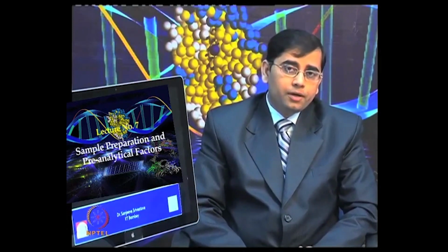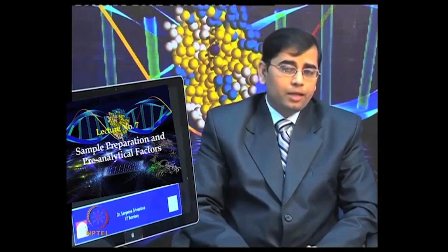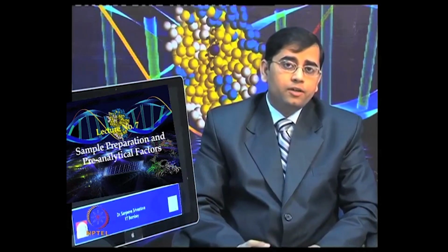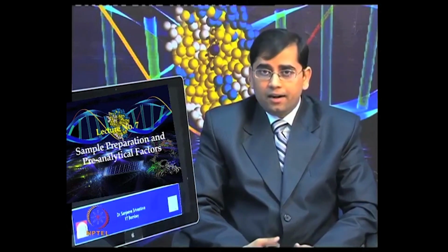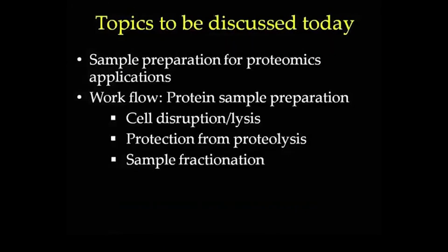An ideal sample preparation will ensure that you have all the protein present in your sample without different types of contaminants such as nucleic acids, salts and other interfering components. In today's lecture, we will talk about the sample preparation for proteomics application.